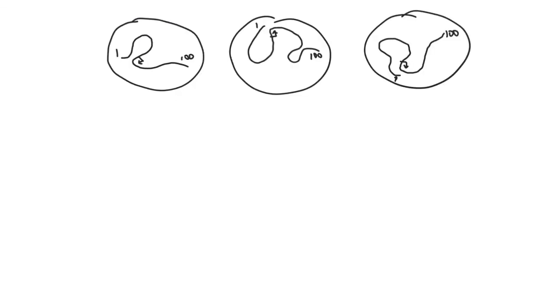So finally, let's take a look at how these data are analyzed and how we interpret the data that come out of all of these different sequencing experiments, like chromatin IP sequencing, ChIP-seq, ATAC sequencing, and 4C sequencing. In this case, I've drawn 3 representative nuclei, again with a chromosome. I'm indicating it goes from 1 to 100 base pairs long, and the position of one gene. So the chromosome may be arranged randomly, or it might not be arranged randomly. And again, that's what we're trying to find out.